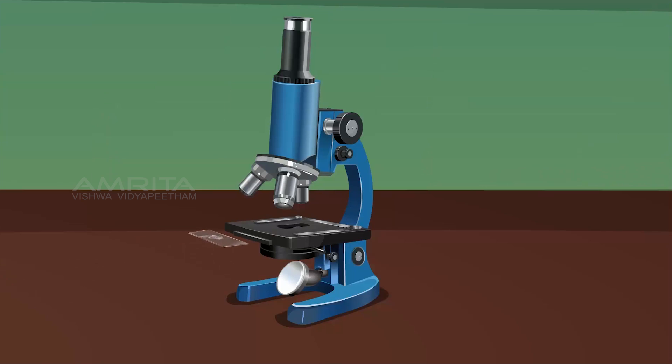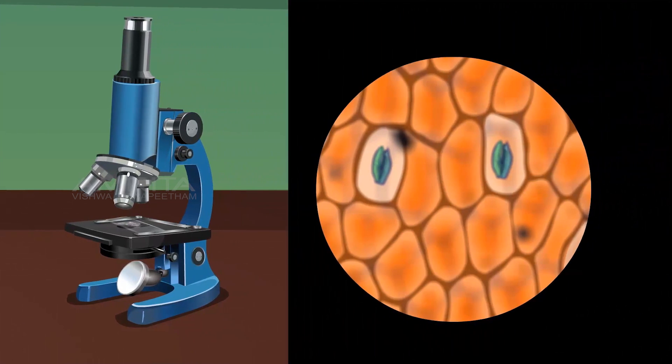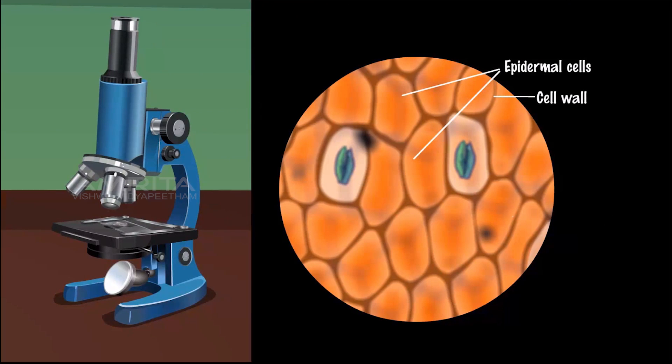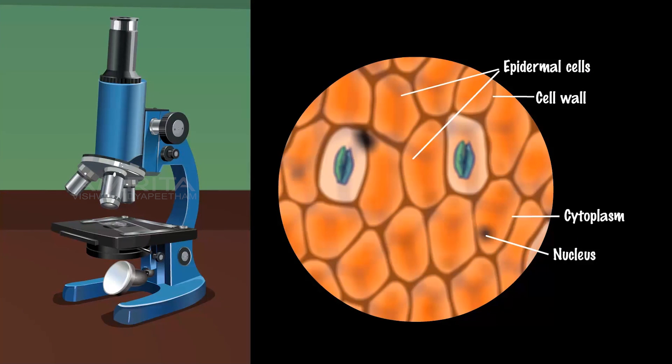Examine the slide under the compound microscope. The epidermis is made of unicariate layers of cells which have distinct cell walls, a nucleus and cytoplasm, and are closely packed together.